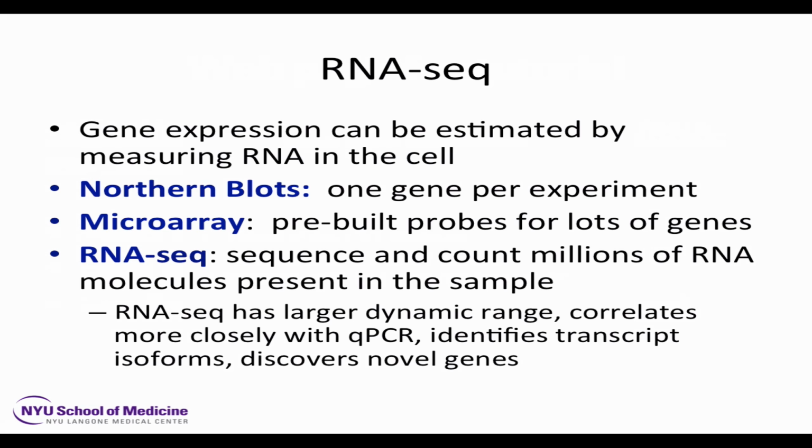If you have a heterozygous sample, or you have different samples that are expressing different alleles of the same gene, you actually have sequences of the transcripts, and bioinformatically you can tell them apart.